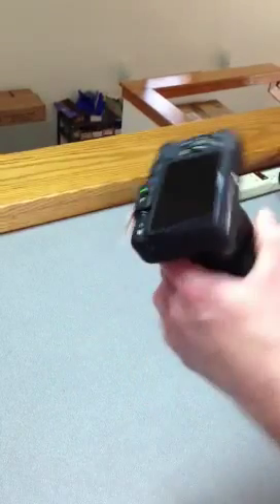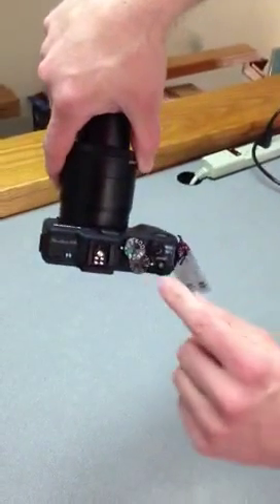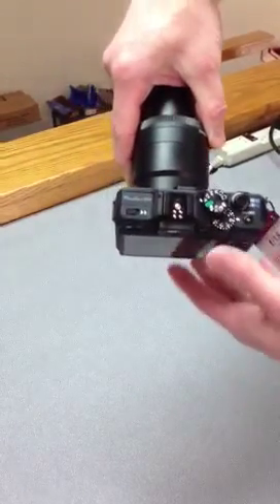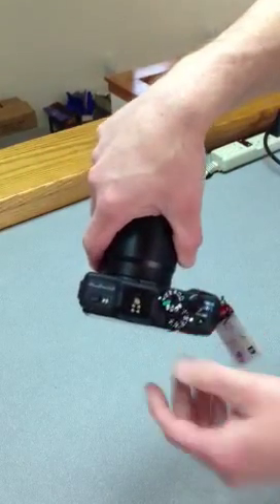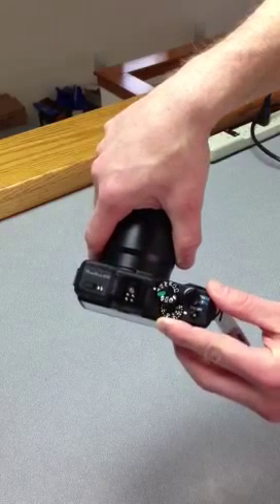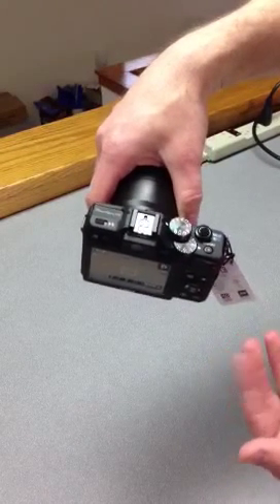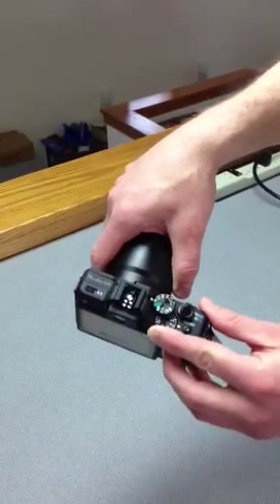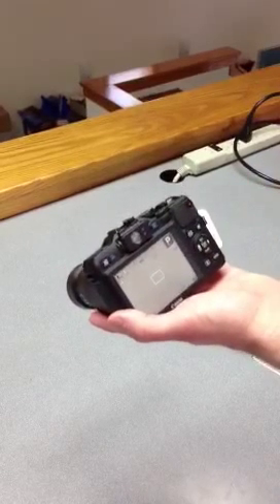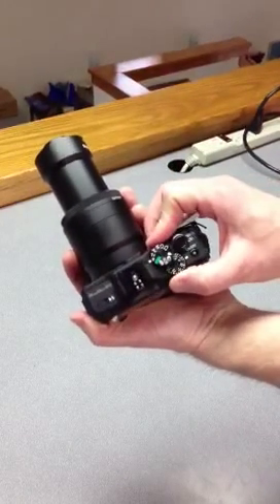That's the only adjustment you need to make that's microscope specific. From there, you always want to be operating the camera on this P — this program mode. The only choice you really have is to set the exposure or the brightness, and that's done while you're in P mode with this little dial here. If you twist it plus one, plus two, plus three, that makes the image brighter. Minus one, minus two, minus three makes the image darker. You can snap an image, and if you don't like the exposure or the brightness, turn it up or down and re-snap it. One thing to be aware of is that the brightness of the live image does not always correspond perfectly to the brightness of the captured image, so sometimes you need to capture a picture first, then determine if you're going to change the exposure.